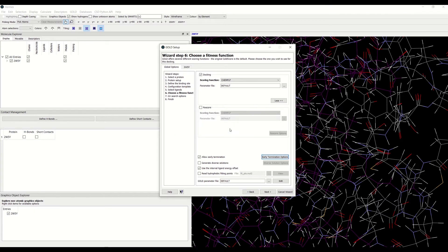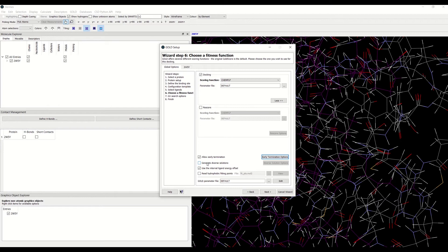Then there is a generating diverse solutions option right under it. There are occasions when GOLD obtains a number of docking solutions for a particular ligand which are very similar.